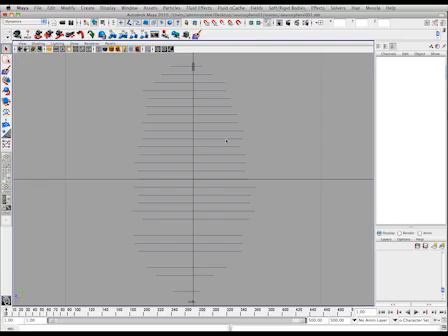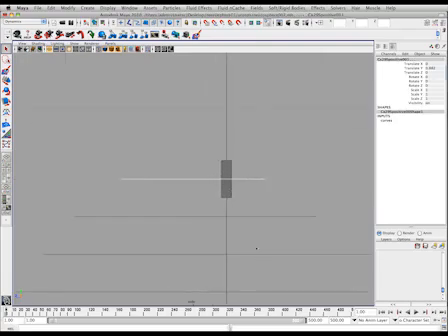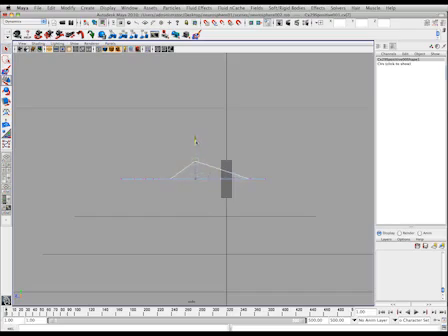The resultant curves are flat when viewed from the side view camera. Approximate the thickness of the sections by shifting the points of the curve in the y-axis using the scale bar as a guide. Repeat this process for each section of the neurosphere.